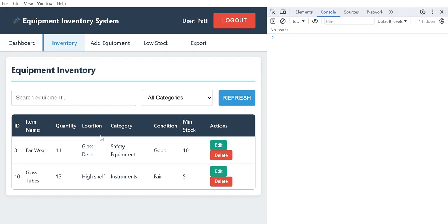The system was designed to allow future expansion and modification through the use of modular programming techniques. Key components such as authentication, database management, and inventory processing were implemented as separate modules, allowing individual parts of the system to be modified without affecting the entire program. And that concludes my showcase. Log out.